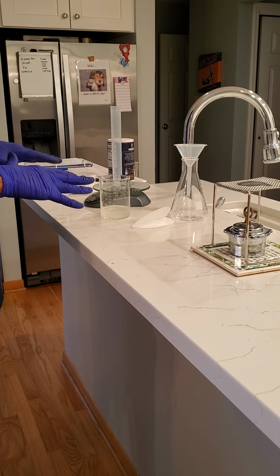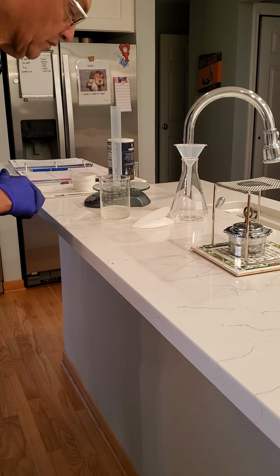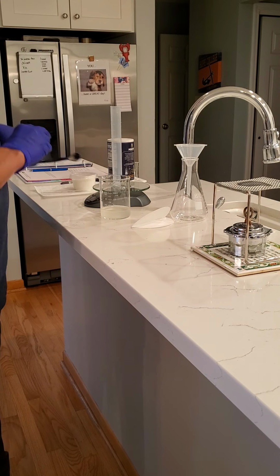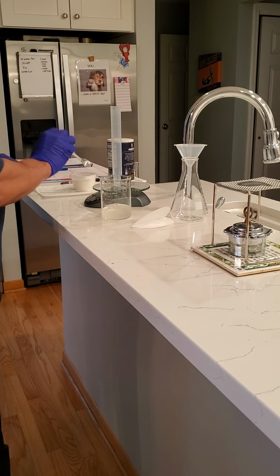So we're going to make a saturated solution of sodium chloride in water, after we know that all the precipitate is as much dissolved as possible in that amount of water. Okay, so we'll let that stir and let that sit for a few minutes, and we'll come right back.